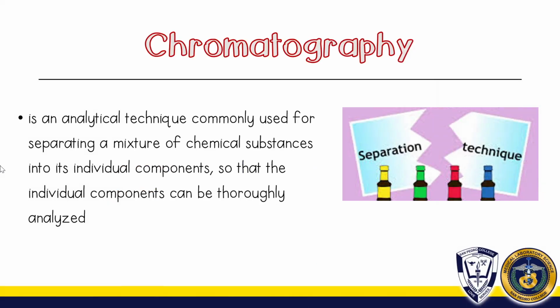So what is chromatography? Chromatography is an analytical technique commonly used for separating a mixture of chemical substances into its individual components so that the individual components can now be thoroughly analyzed. So basically, chromatography is all about separation.